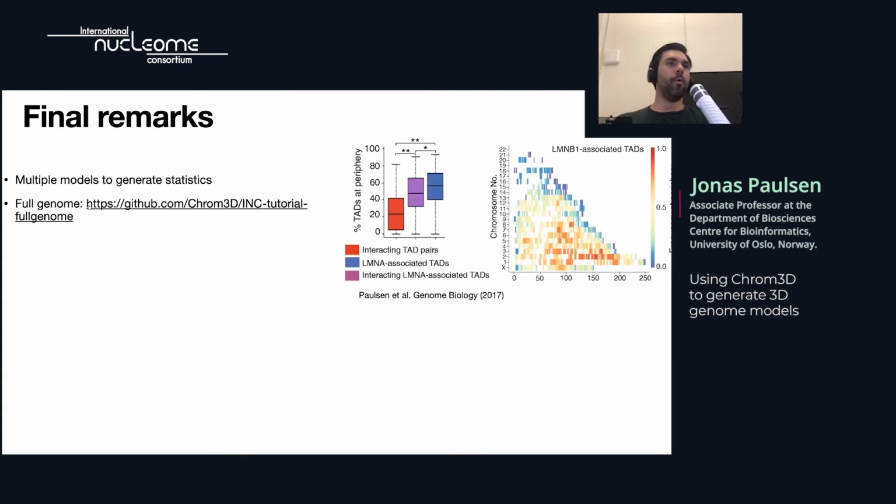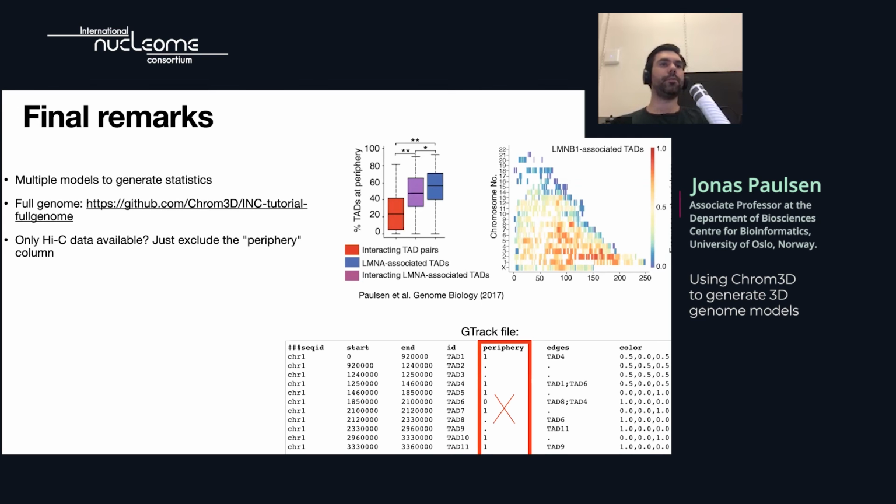If you want to read more about running Chrom3D, we have a Nature Protocols paper that was published in 2018, where we also go through and explain the steps needed to run Chrom3D. But in the tutorial today, I showed you how to go from the raw data all the way up to the model visualizations.